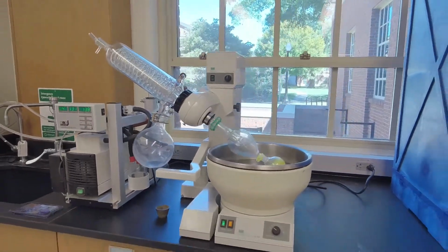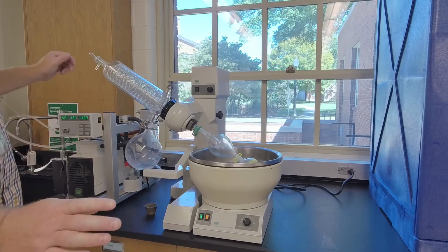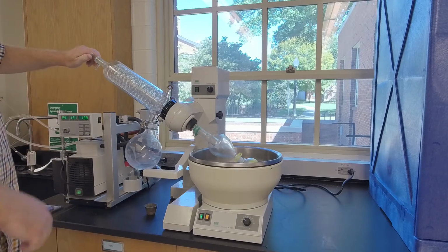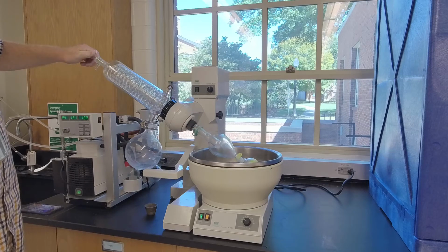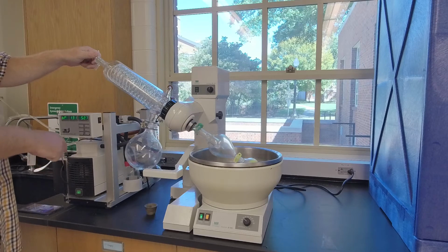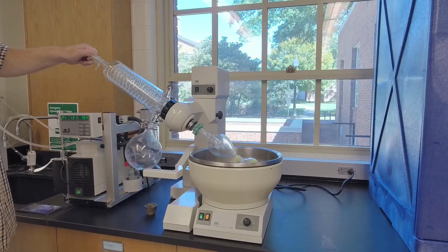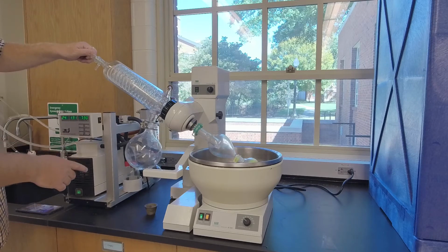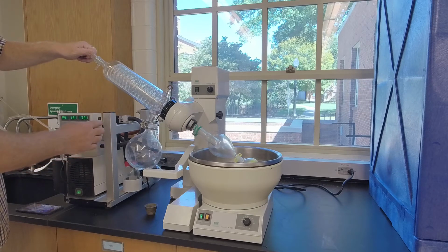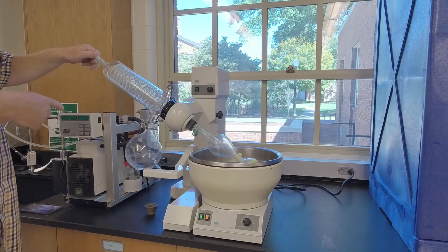So how do we then reverse this? What's the steps to reverse it? All right, the first thing you want to do, open up the stopcock, release the vacuum. You never want to shut the pump off before releasing the vacuum. And in fact, I'm going to kind of cheat and pull this out all the way. And now I'm just going to turn this off. When you do this in the lab, don't turn this off, all right?